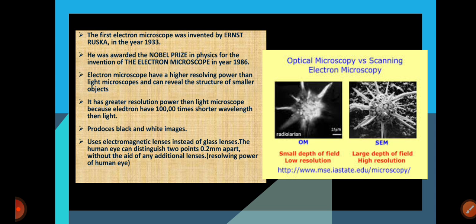These were the standard tools for viewing microscopic details before the electron microscope. They use lenses to focus visible light and magnify images of the specimen. But in the electron microscope, scientists used a beam of electrons instead of light, allowing for much higher magnification and resolution, revealing details at the nanometer scale.